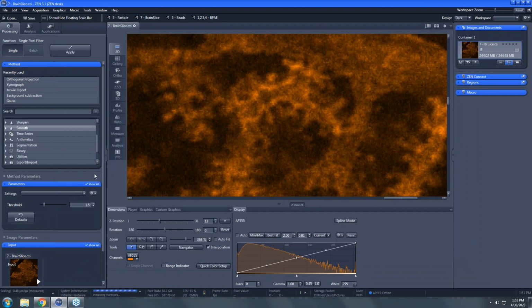Okay, sorry about that, Nicole. No, that's great. That's a great way to impress somebody if they ask you, how did you get this image to look so pretty?